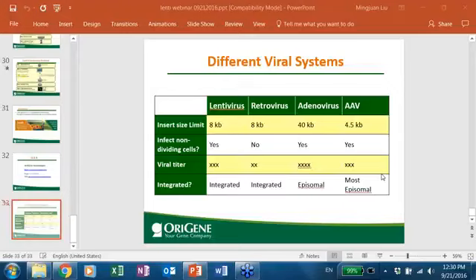So one question is, after lenti transduction, does it mean the cells can be selected as a stable cell line? The answer is, if the lentivector has a selection marker, such as our shRNA, which always has a puromycin selection marker, and the lenti-ORF is also available in pure vector too, you can use the antibiotic to select your stable cells. But the cells you select are a pool because the integration is at different sites.